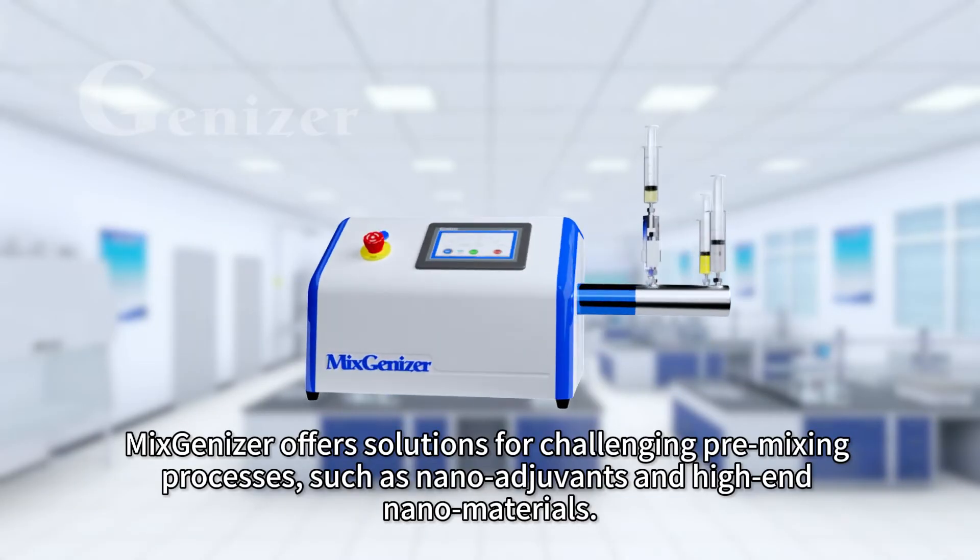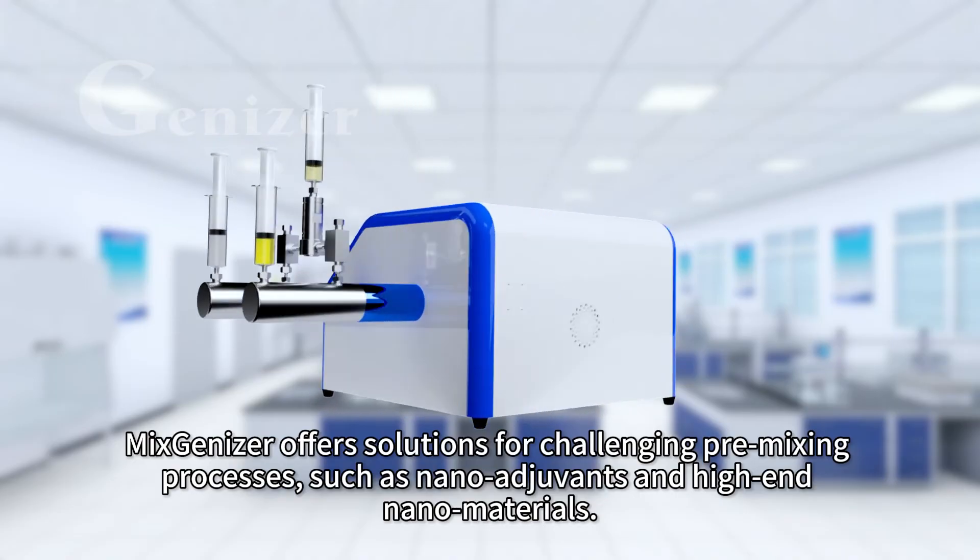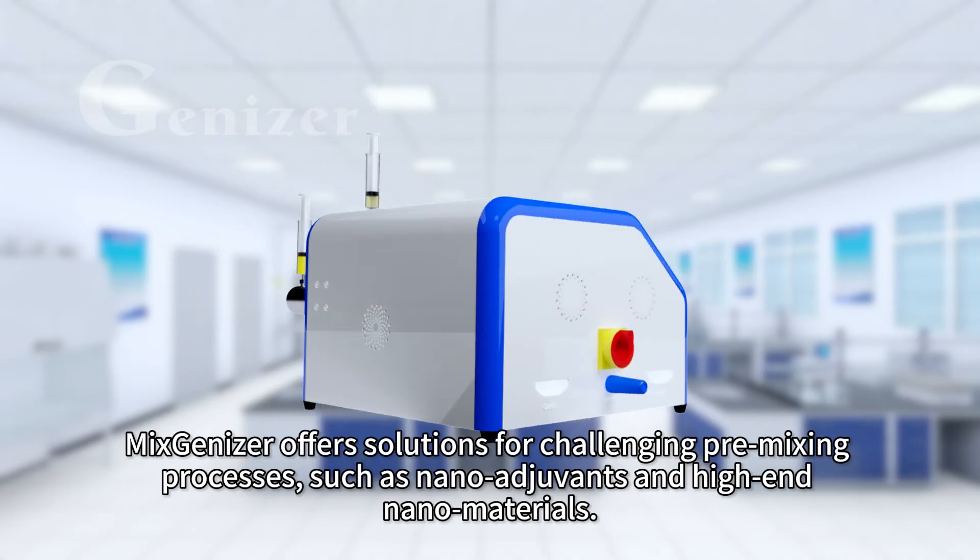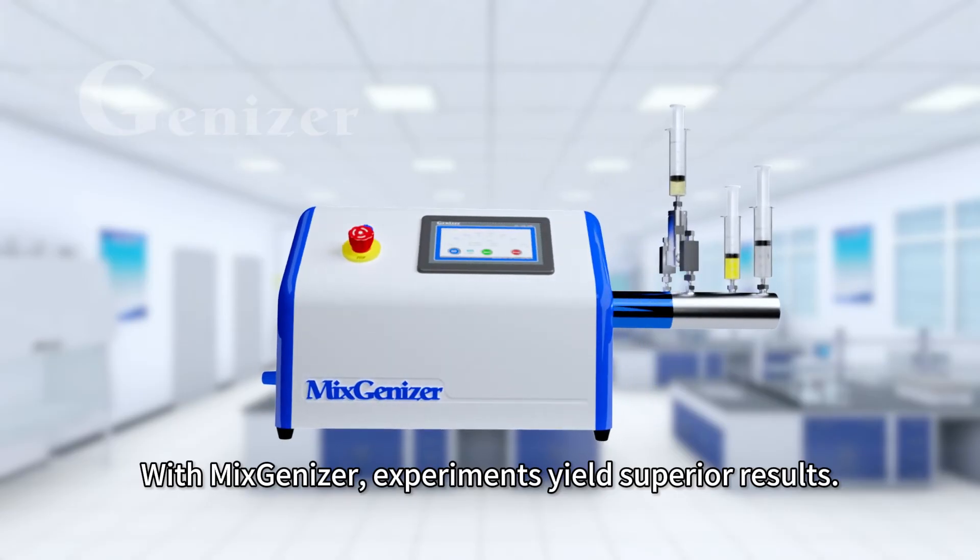MixGenizer offers solutions for challenging pre-mixing processes, such as nano adjuvants and high-end nanomaterials. With MixGenizer, experiments yield superior results.